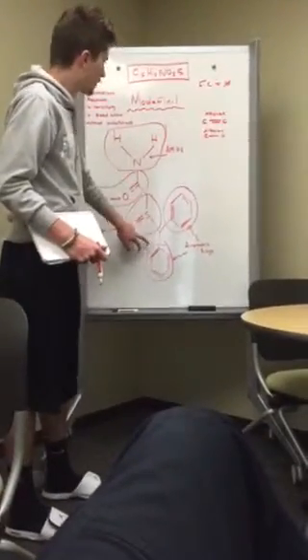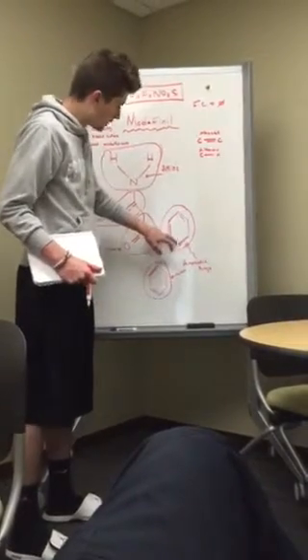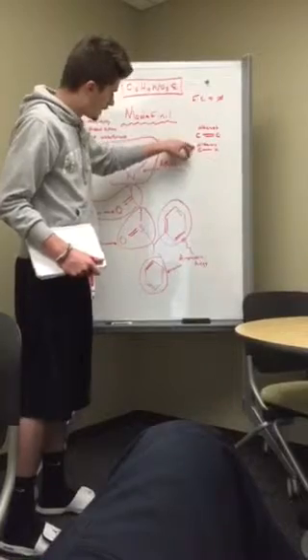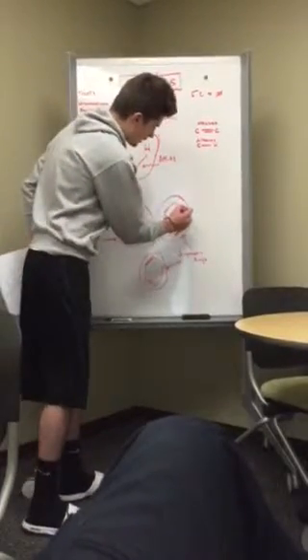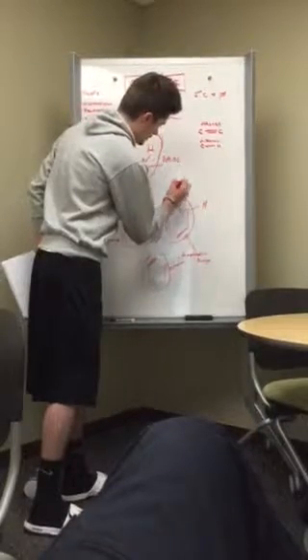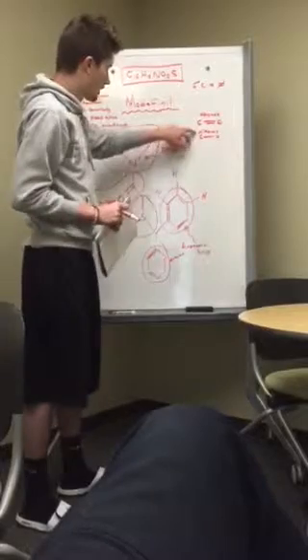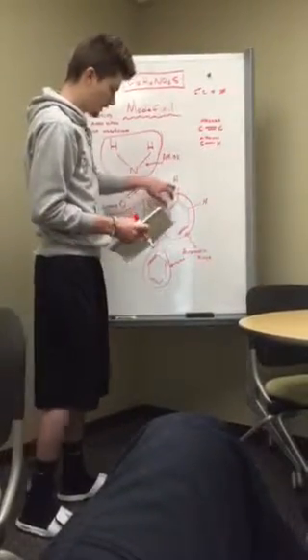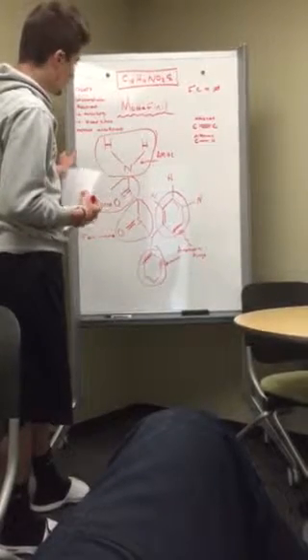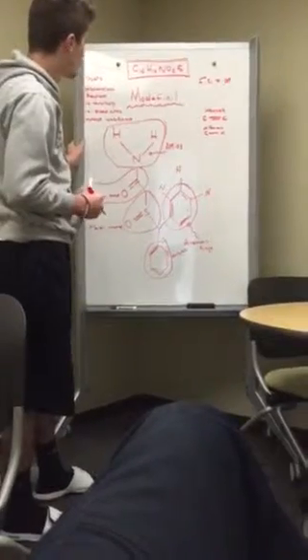And within these aromatic rings, there are alkenes, which are labeled as C to C double bonds, which would be here to here. Then we have alkanes, which would be, like I said, these branch off from a C to an H, respectively. These single bonds are alkanes, which is a C to an H. And that is the skeletal structure, broken down into functional groups and IR spectroscopies of the functional groups.